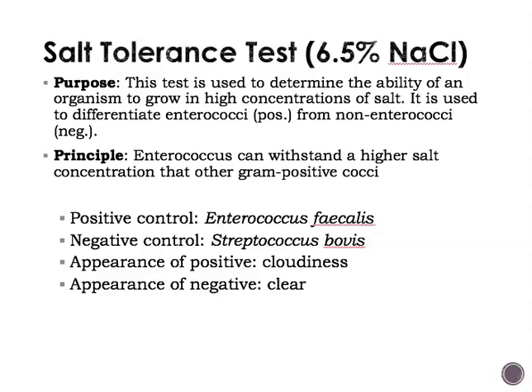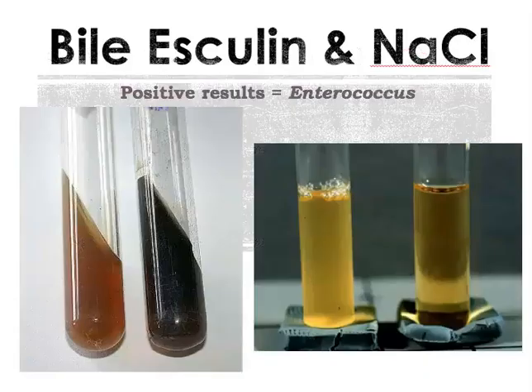Enterococcus can withstand a higher salt concentration than other gram-positive cocci, so it will grow in the presence of this increased salt. If you remember, that's our bile-esculin slant agar on the left with a negative result, and a positive result on the right. This is our 6.5% sodium chloride or salt tolerance test, which is a liquid broth.